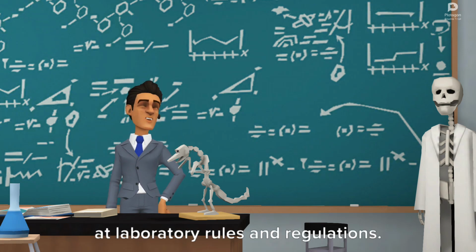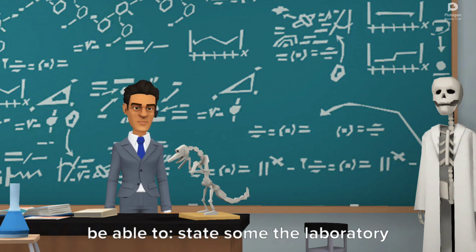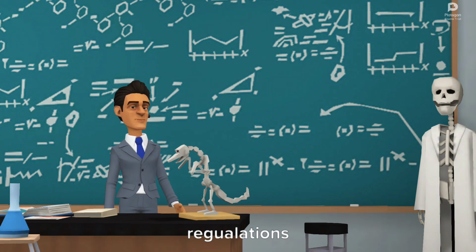Class, today we are going to look at laboratory rules and regulations. So by the end of this lesson, you should be able to state some of the laboratory rules and regulations, explain reasons for the laboratory rules and regulations.